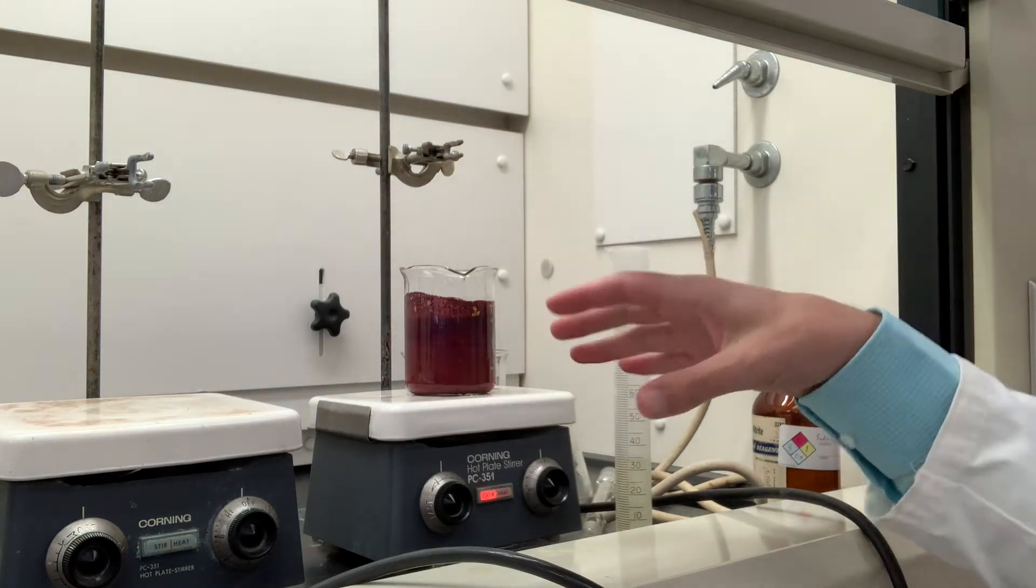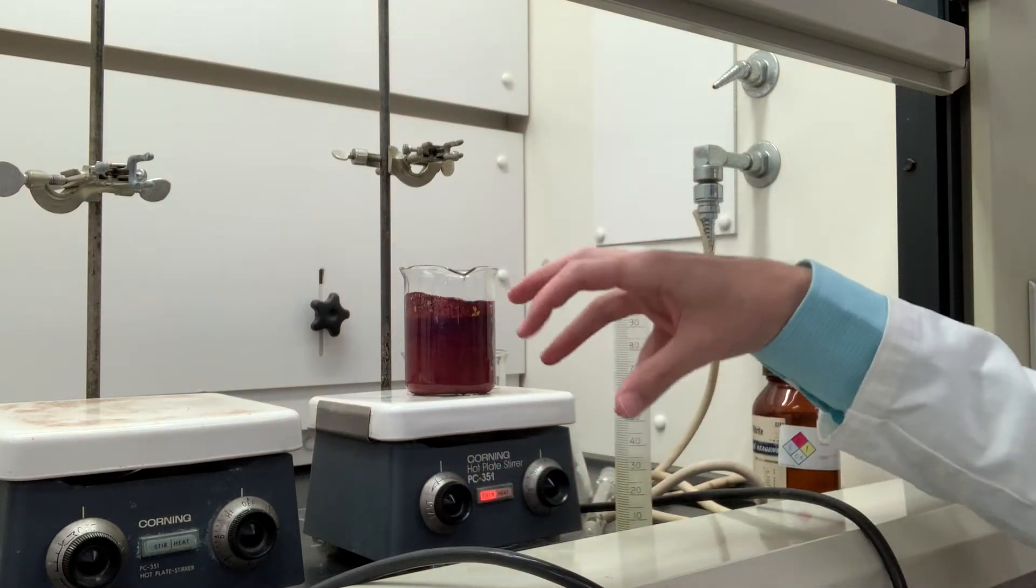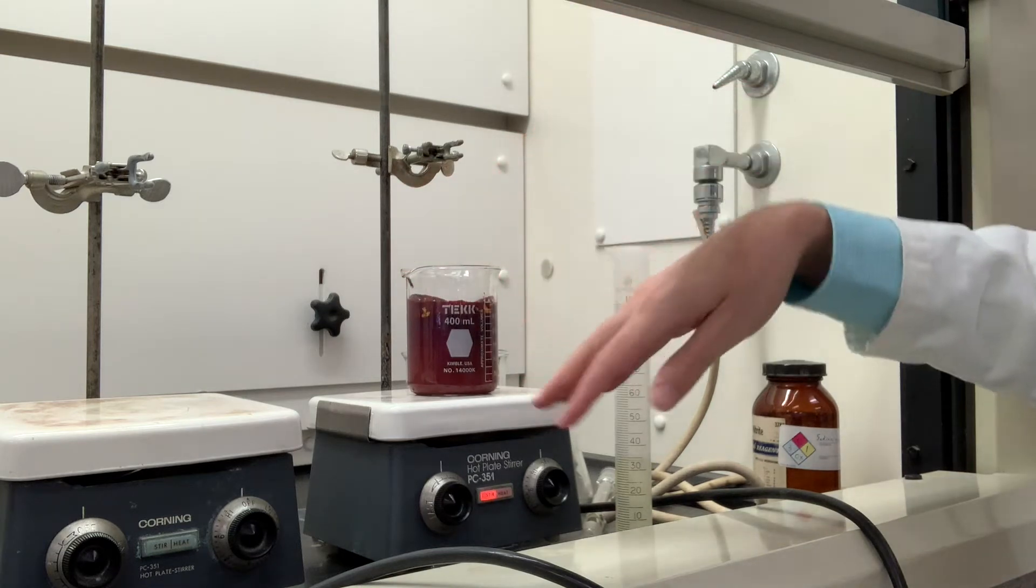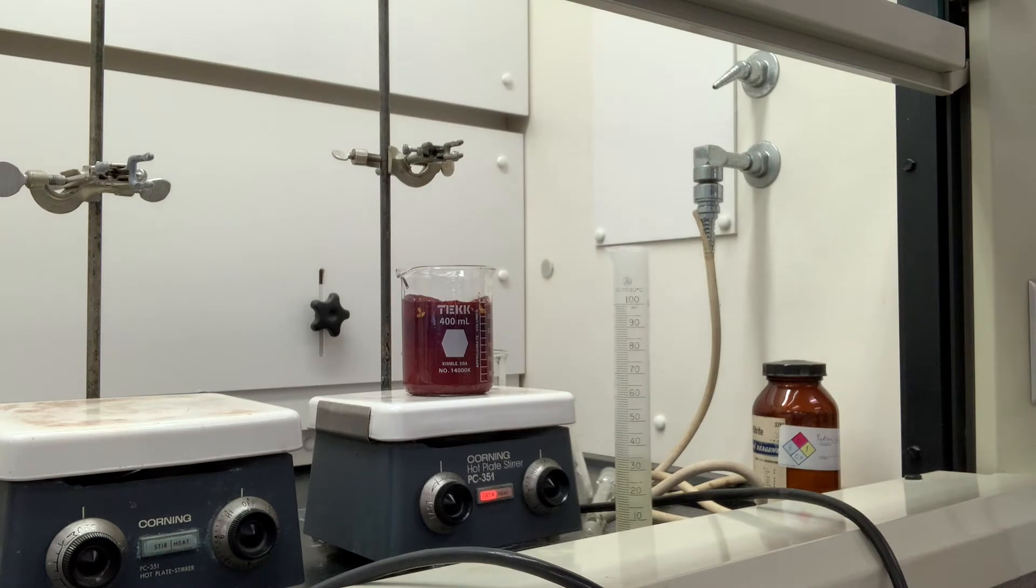Remember that methyl orange is kind of orange and yellow in a basic solution and it's red in an acidic solution. Because of all the hydrochloric acid and acetic acid that we've added, it's under an acidic condition right now.